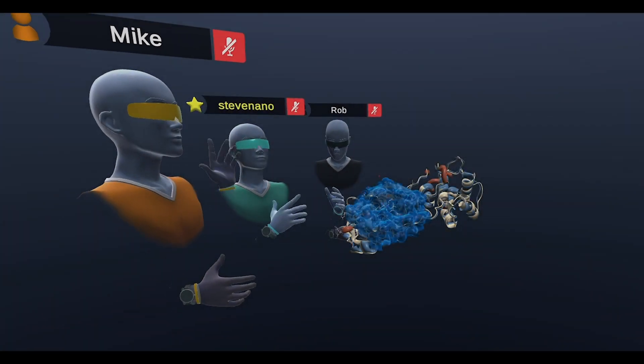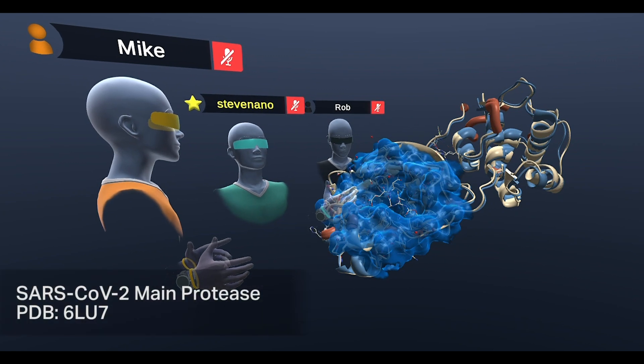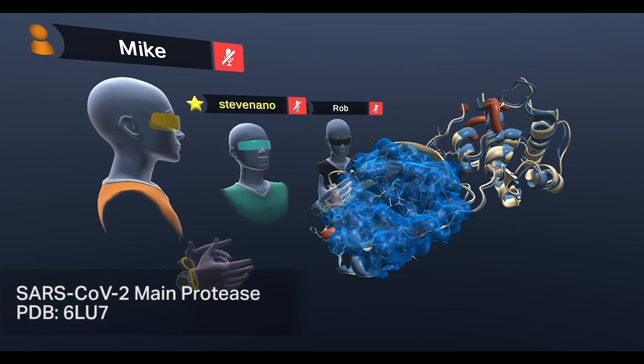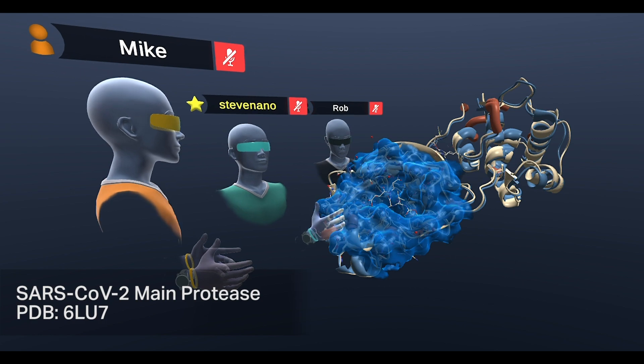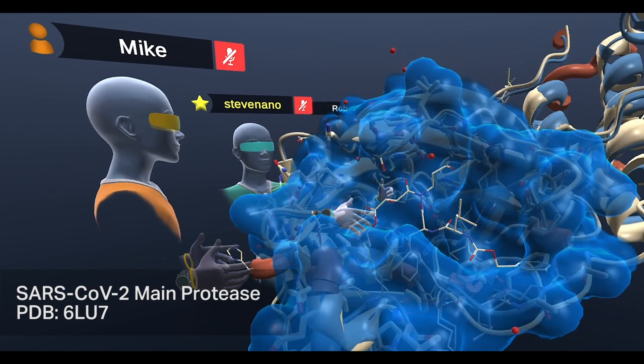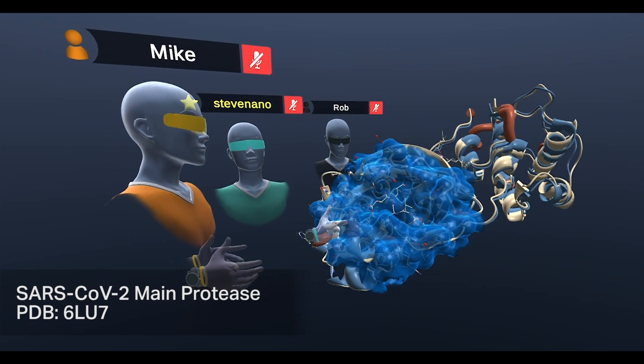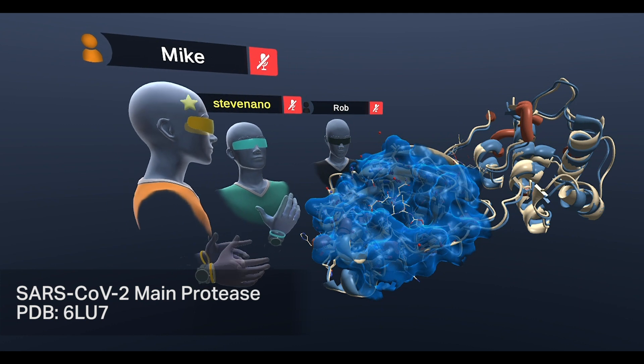Hi everyone, for this month's Nanome of the Month we're actually going to be looking at the protease for the SARS coronavirus that is happening right now with COVID-19, and we're going to explore ways where we could develop a small molecule protease inhibitor that'll fit into this binding pocket and help actually eradicate this disease.